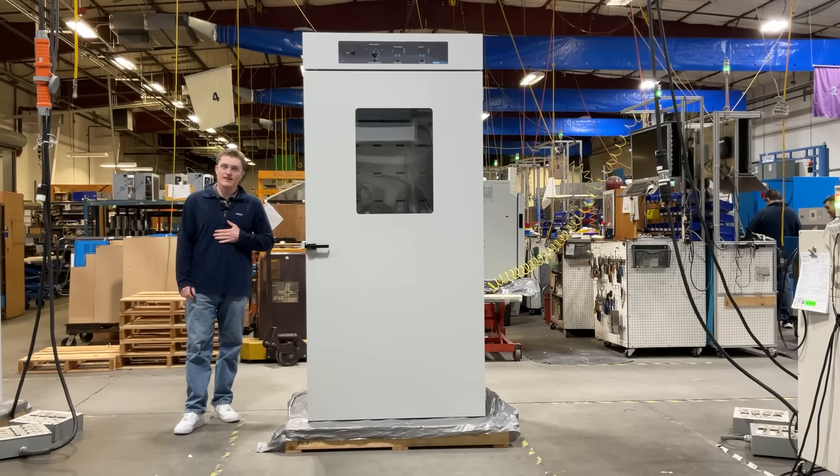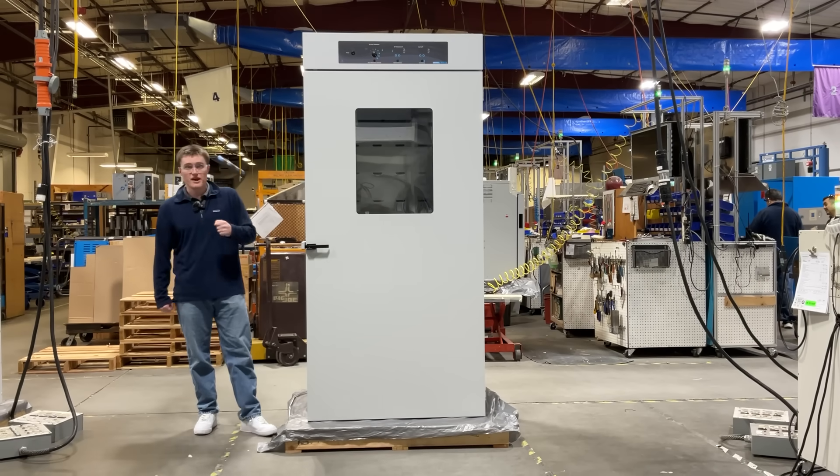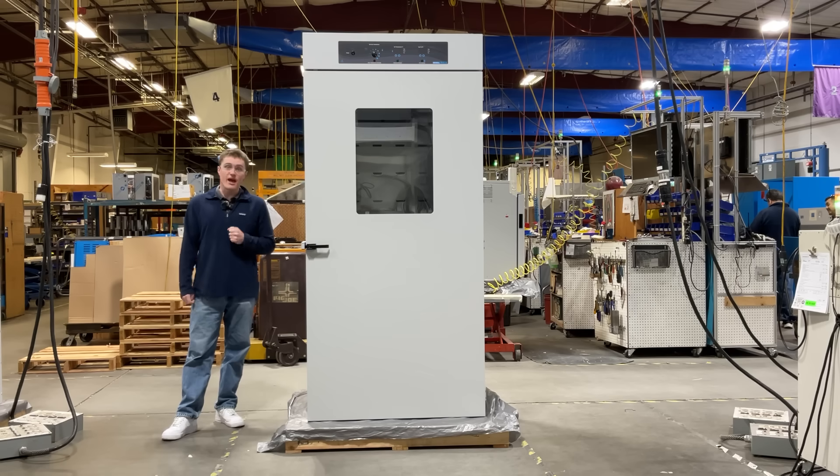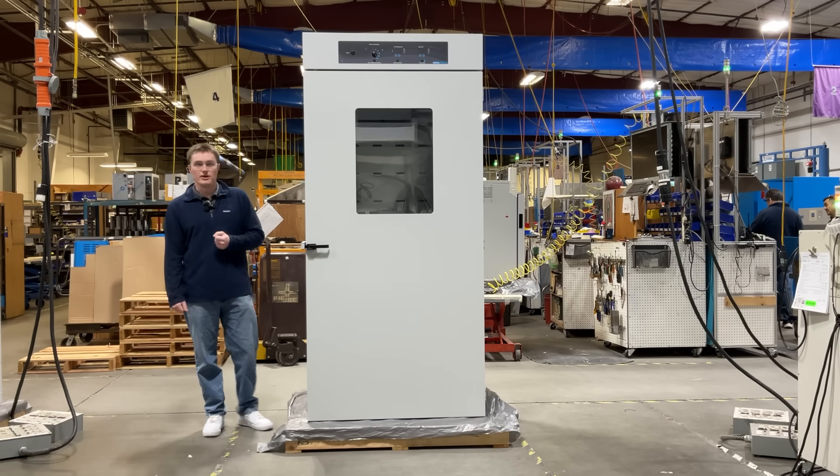Hello again. My name is Kors Sangstake. I'm a design engineer here at Sheldon Manufacturing. Today, I'm going to be introducing the Shell Lab SCO40 Large Capacity CO2 Incubator.